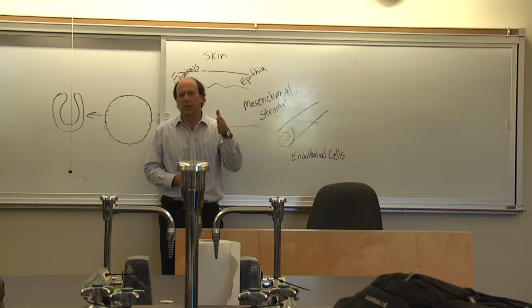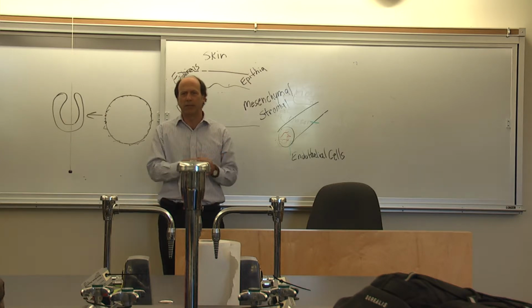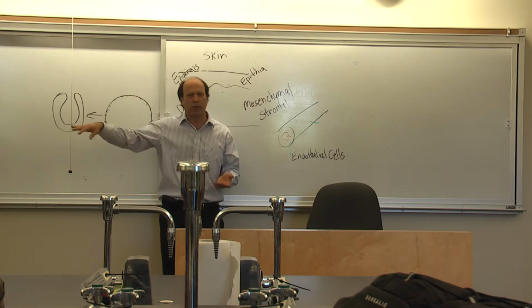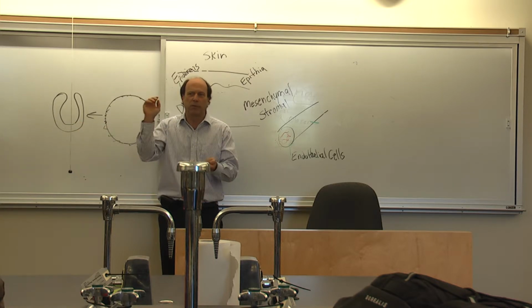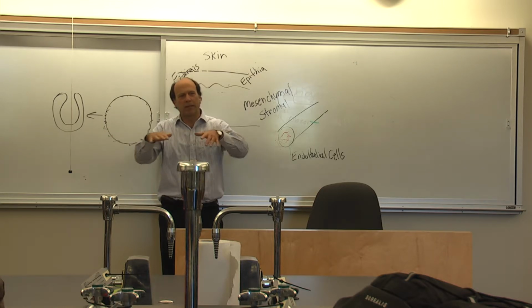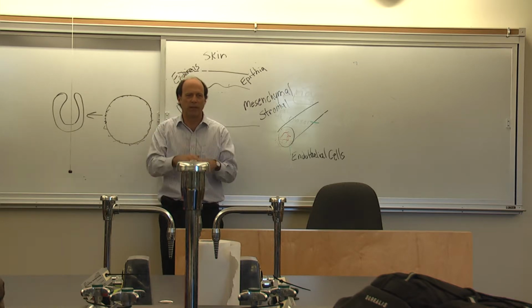So it's going to take a series of still pictures, almost 1,000 of them, like 900 and something pictures. If we take that stack of pictures and feed it to a program like QuickTime, it will compile the pictures and flash through them all in 30 seconds. So it will look like things are moving, and that's the way a movie's made anyway. It's a series of still pictures, right? And they keep changing a little bit, and so you see the motion of something. So we can make a movie.